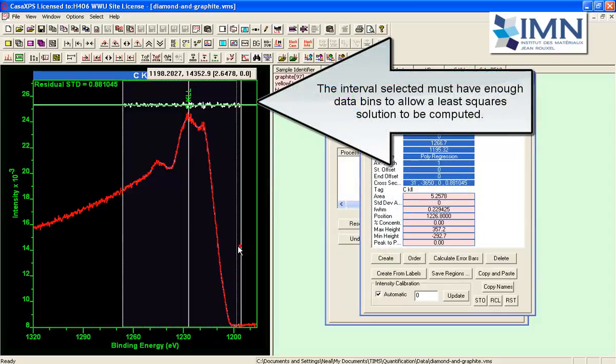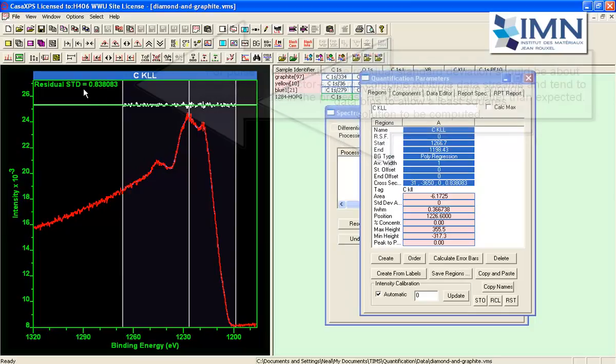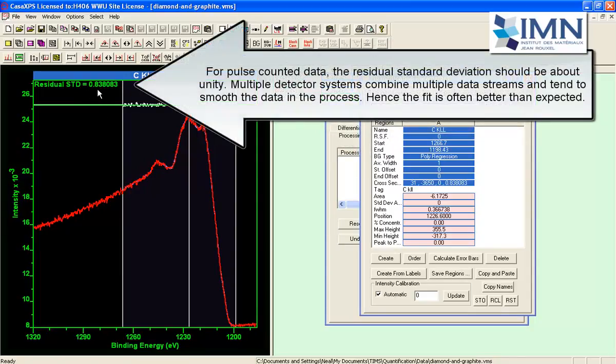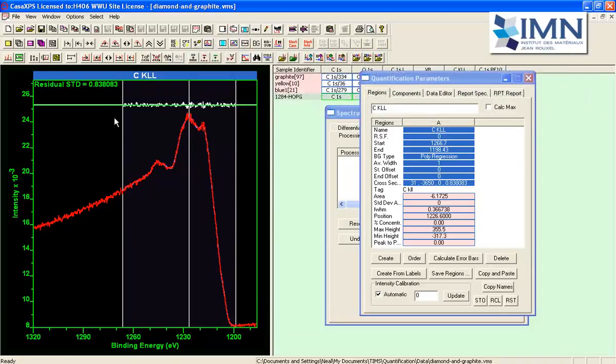And if I just get this right then I come up with a residual standard deviation that would be characteristic of pulse counted data which has been combined from a multiple detector system so it is less than one.